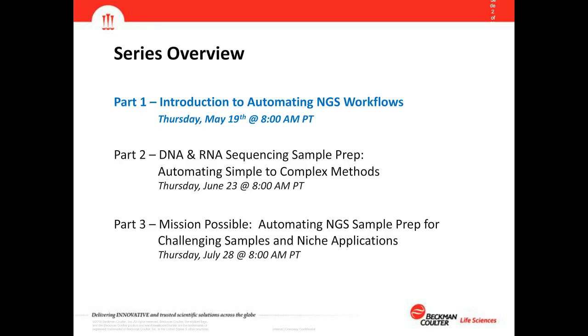The third part of the series is entitled Mission Possible, Automating NGS Sample Prep for Challenging Samples and Niche Applications. So we'll be discussing some of the applications that are becoming available for niche markets and how we address challenges of manual processing for those chemistries.